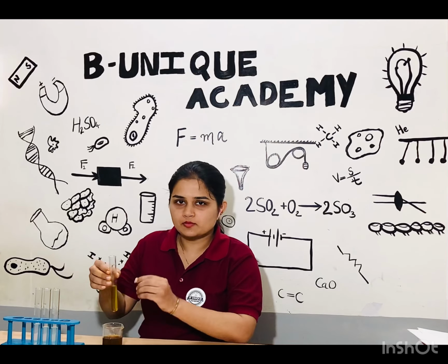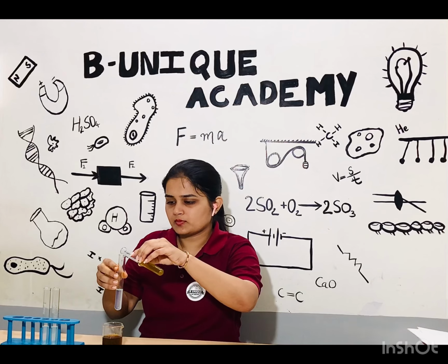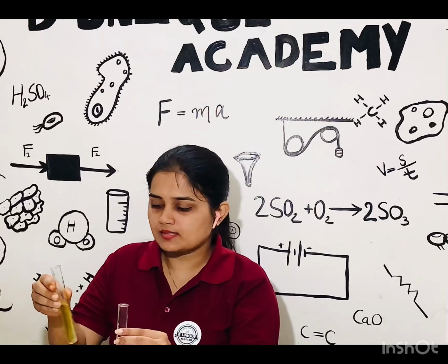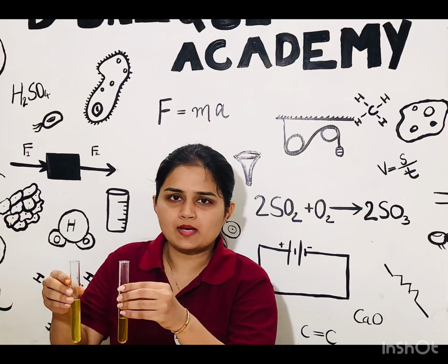From the same test tube, I am going to add 10 ml of solution in the next test tube. It is observed that this test tube is also colored, but you can compare the color of first test tube and second test tube.